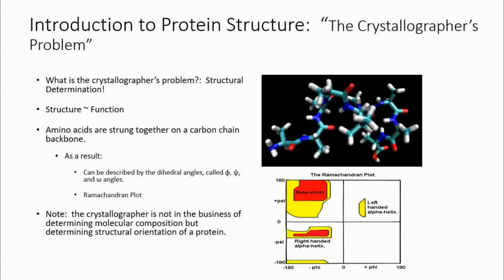So what we have to do is first understand the structural orientation, and how this structural orientation can be narrowed down to the atomic level, and from the atomic level what information we can decipher by passing x-rays onto this and getting a scattering upon passing through these structures. And once we get this scattering, we get spectra. So the spectra have certain things to tell us, and we have to understand what these patterns of spectra are actually giving us information about, right?